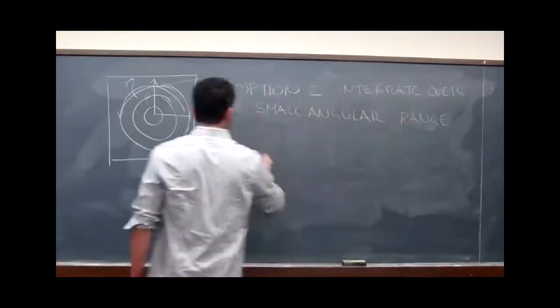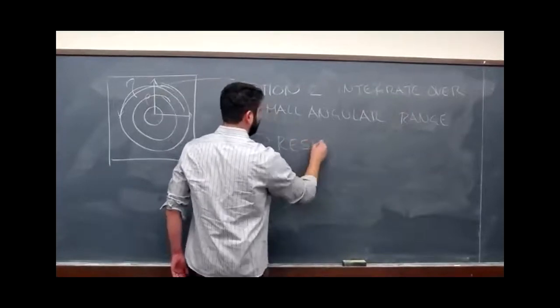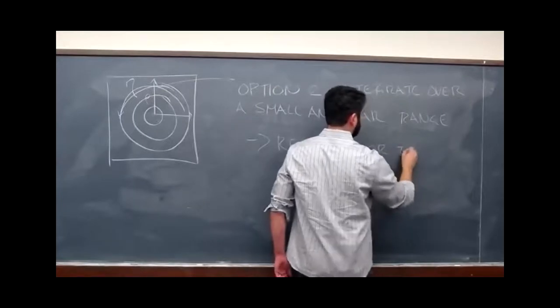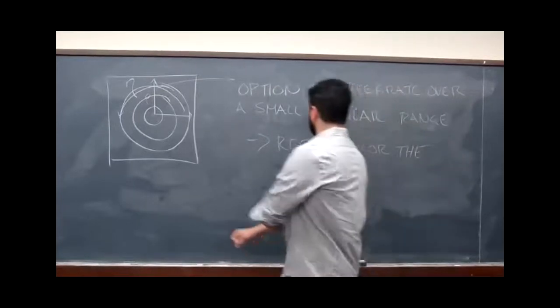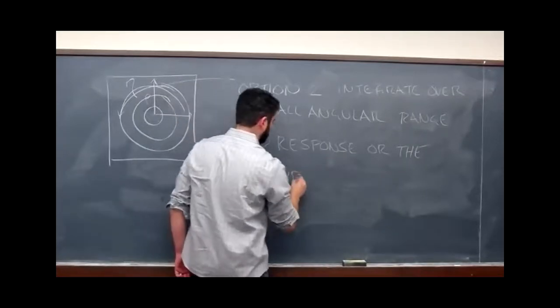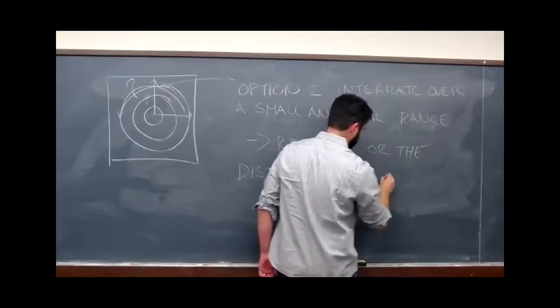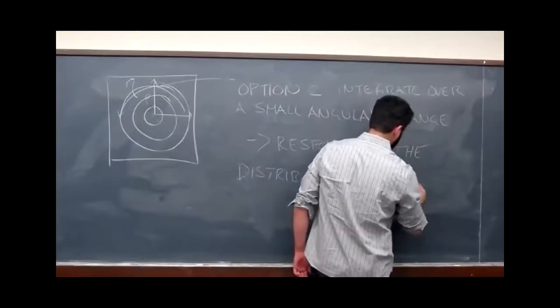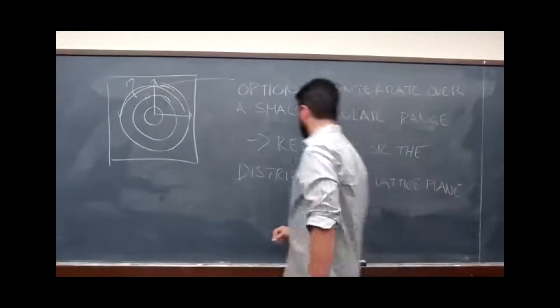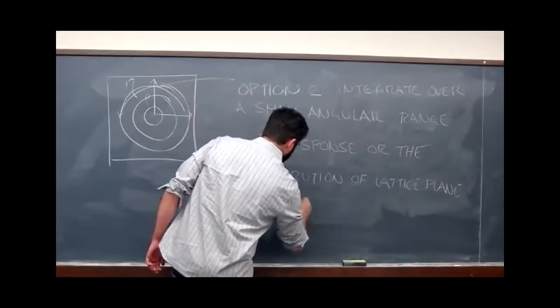We want to do this when the response or the distribution of lattice plane orientation is anisotropic.